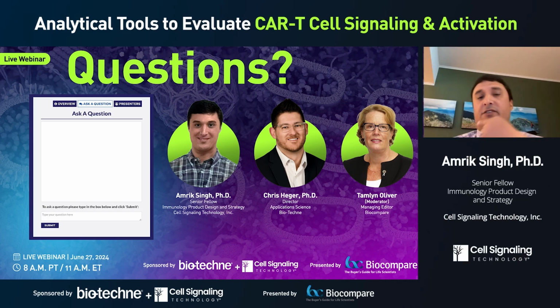Oh, that's a great question. So for scFv-based CARs, protein L likely will not work in CARs that do not contain an scFv for target binding, and that's because it binds to sequences in the variable domain of the scFv.